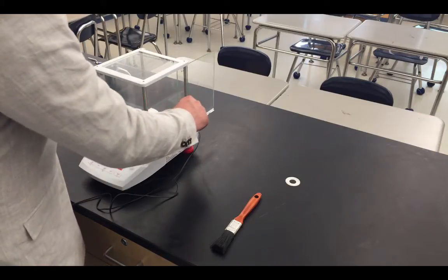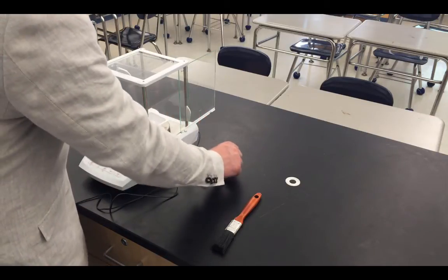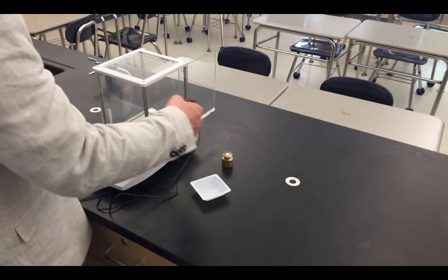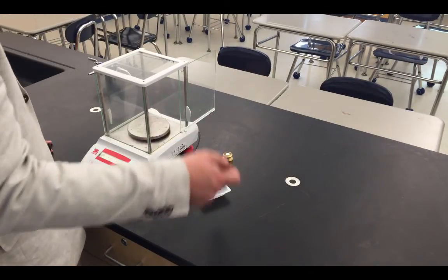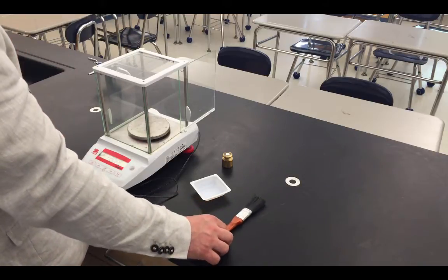When you are done with your sample, the last order of business is to take your chemicals off. Make sure once again the balance is cleaned by using the brush to brush off any chemicals that you might have spilled. This ensures that the balance stay in good shape and it's ready for the next person to use.